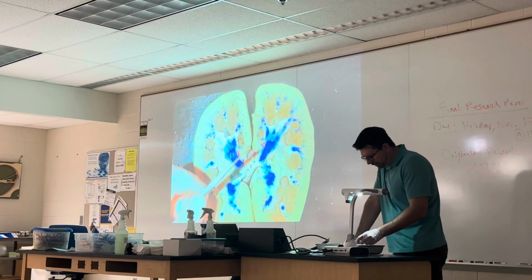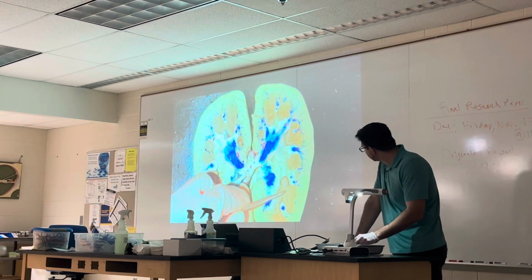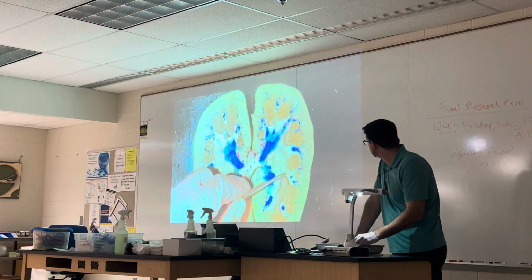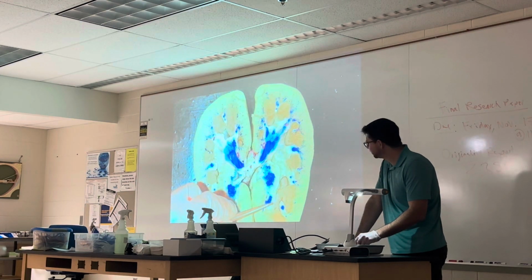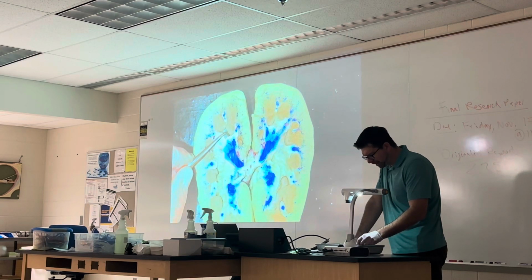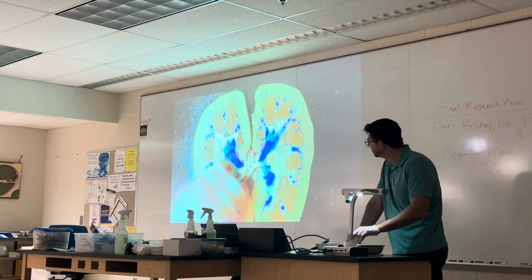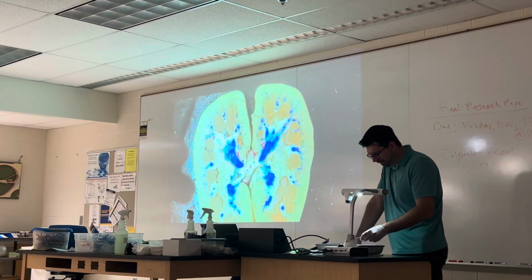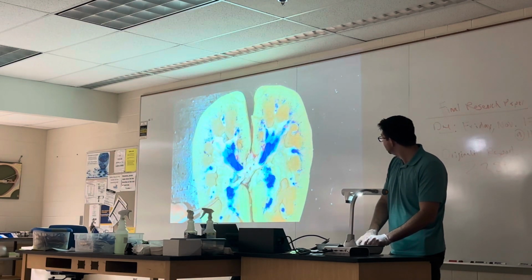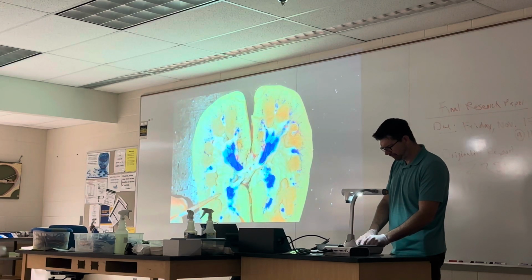Other structures to know, kind of right off the tip of where you have a renal pyramid, this area over here would be a minor calyx, or down here a minor calyx. It's kind of a deeper structure, so I'll do my best to find a kidney that shows that pretty well. Looks like there's an excessive amount of blue dye put into this for the blood vessels, so this may not be the best choice, but right over here is where you'd find a minor calyx. It's always going to be in front of the renal pyramid.